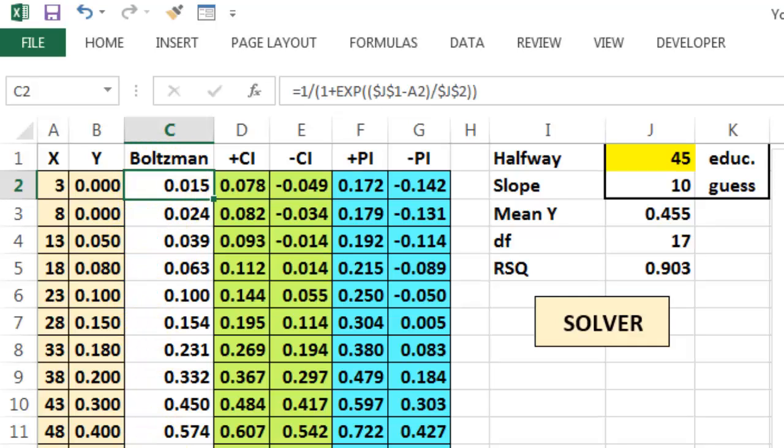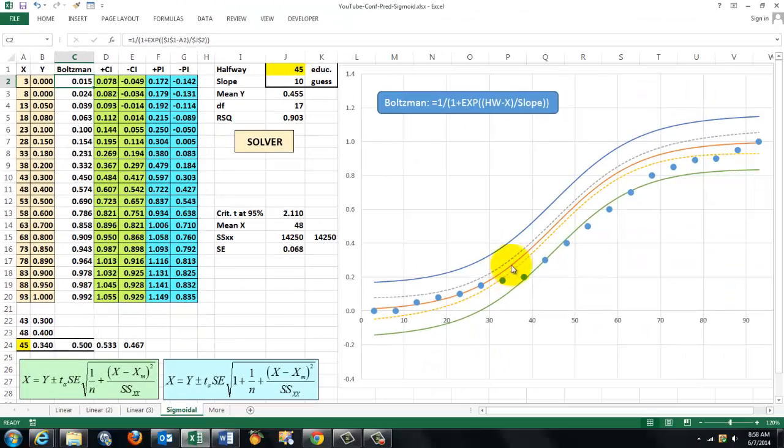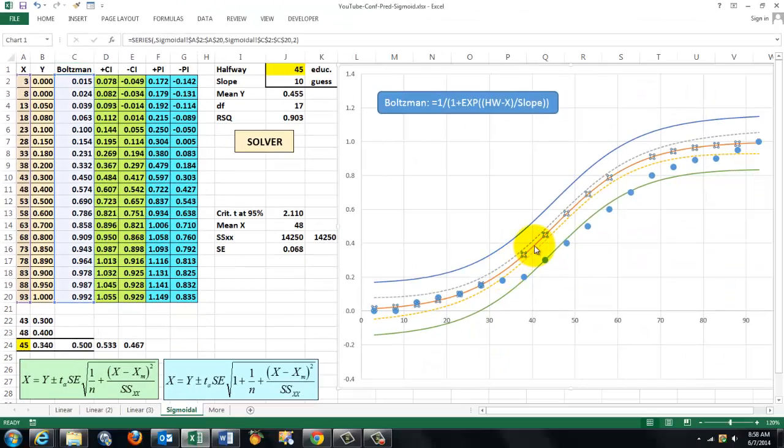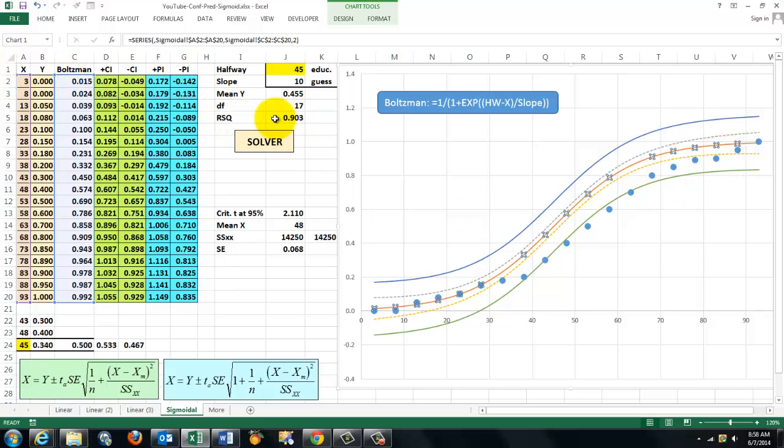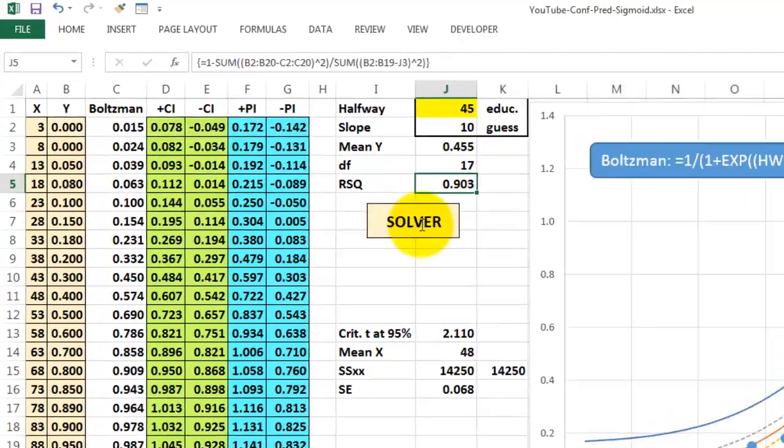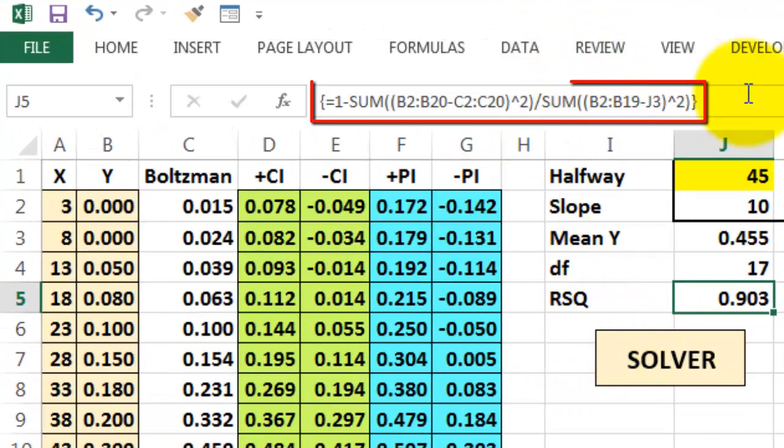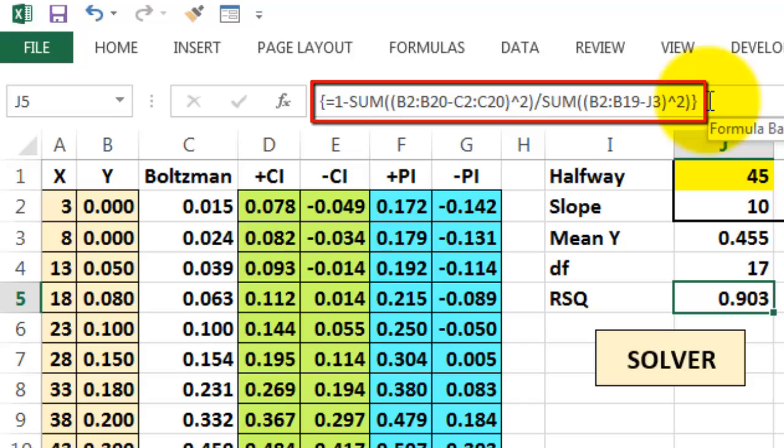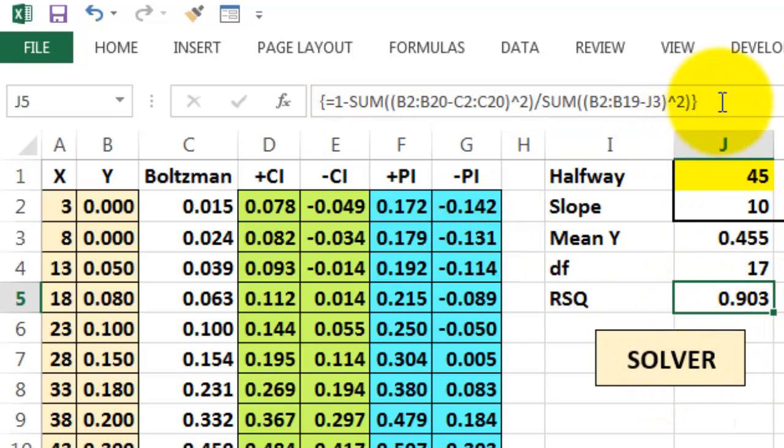But before I'm going any further, I want that curve, that is this one, I want that one to be nicely hugging my observation points. We do that with solver after we have calculated r squared. How do you calculate r squared? You can do that with a function, but not in this case because we want solver to check everything.